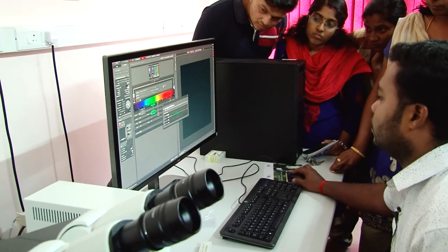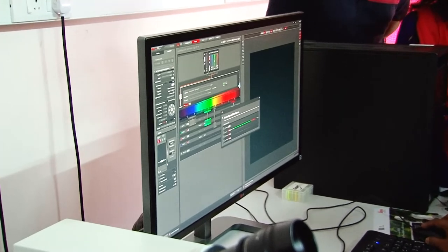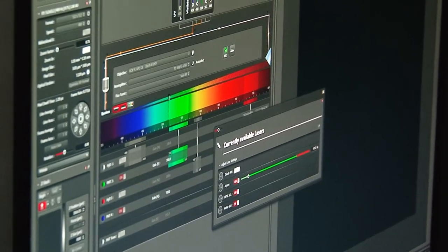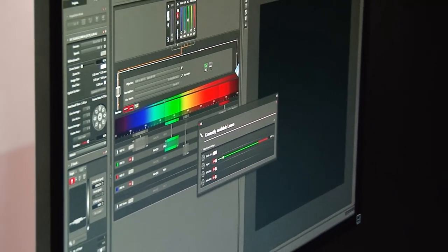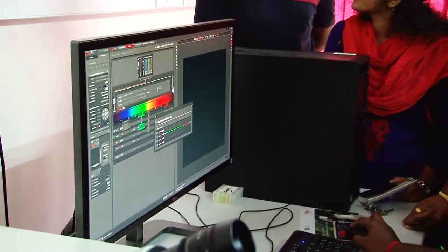And this diode is not switched on right now because it is a UV laser. So we have a UV diode laser, 405 to 450. So less than 405 we can't do it. Somebody yesterday asked that they have it in a 343 or 3-something excitation range. So we can't do that. So we first switch on this laser. I know this value, so that's why I just selected the green one.